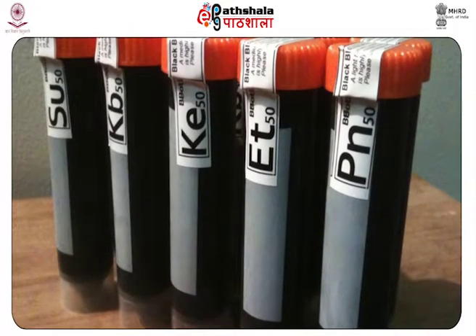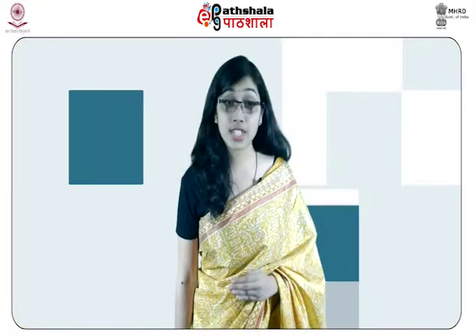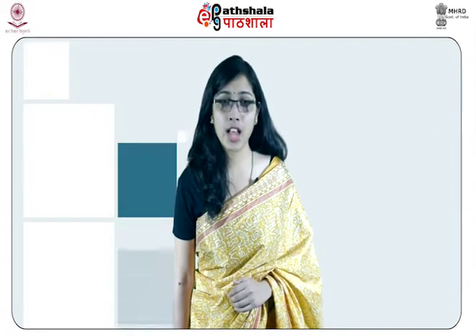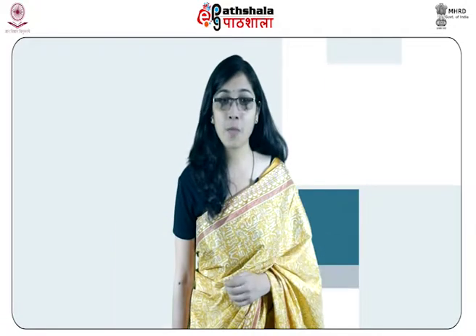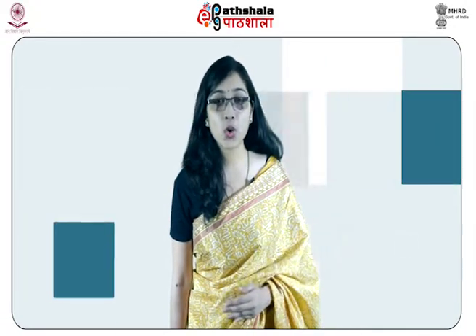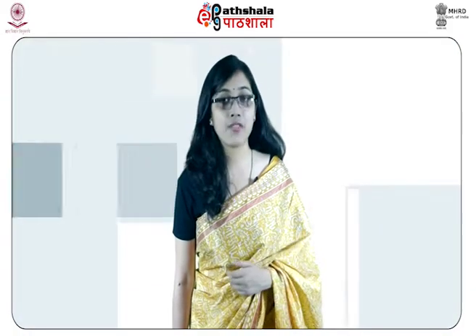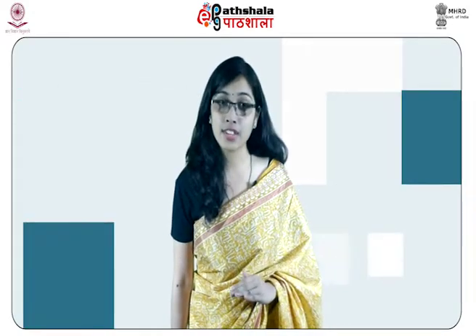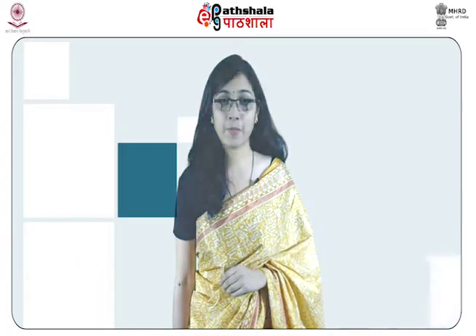A third sample is collected on a piece of a clean rag. A stain on a piece of clean white cotton cloth about 3 cm square with some unstained part of the cloth for control test is sufficient. The stain is dried and packed in a clean envelope or bottle. Needless to mention that the materials should be uncontaminated and dry.